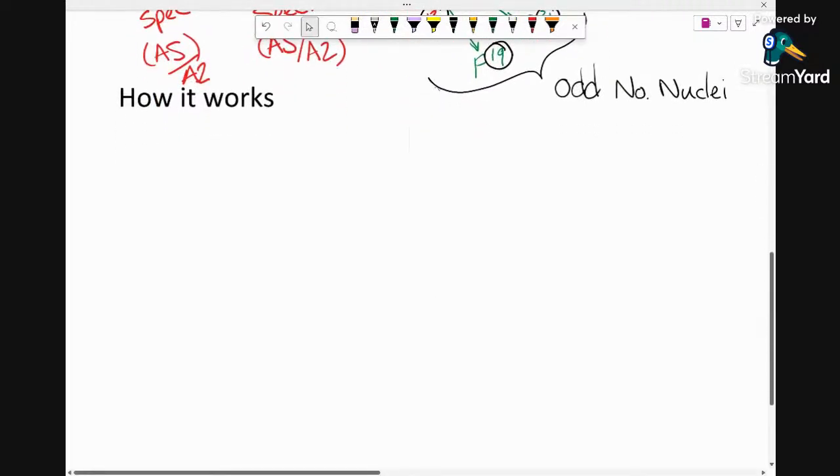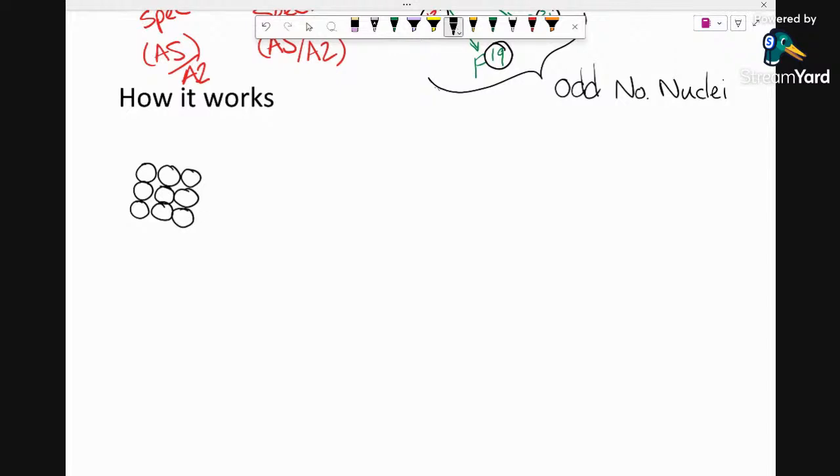So I think the first thing it's good to describe here is to have an understanding of how you prepare a sample. This is commonly not really discussed by teachers in lessons. They tend to just jump right into the actual theory of the machine itself. But actually, there's a really reasonable process here. So let's say that we've got a sample. I'm going to take a sample of a solid. And what I'm going to do is identify a single particle in the solid.